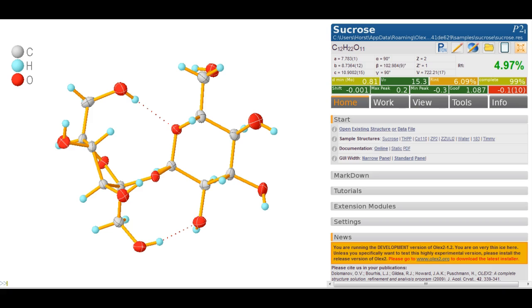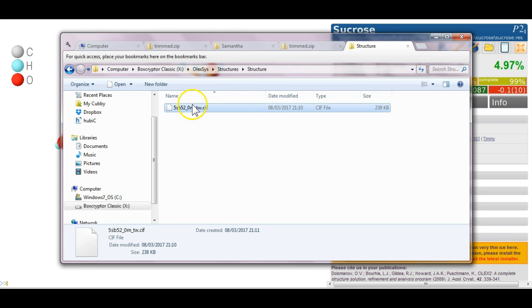Hi, in this video I'll show you how you can deal with a combined CIF file. If somebody sends you a CIF file that is rather large, it may be a combined CIF file. I've taken a file that somebody sent me and it's 239 kilobytes. It's rather large for a CIF file, so it probably contains some combined information.